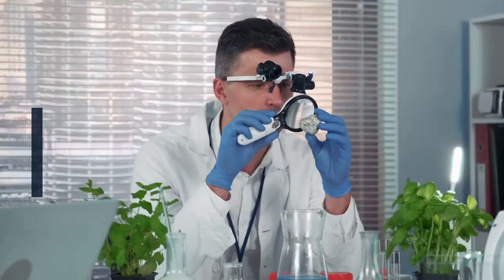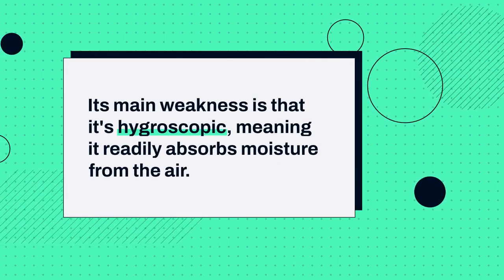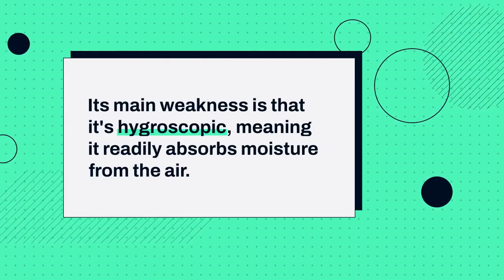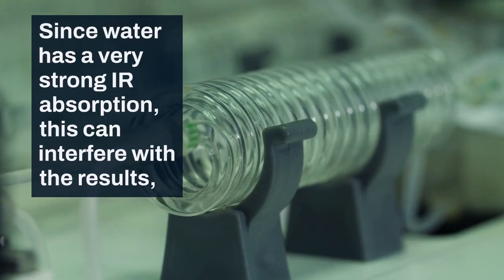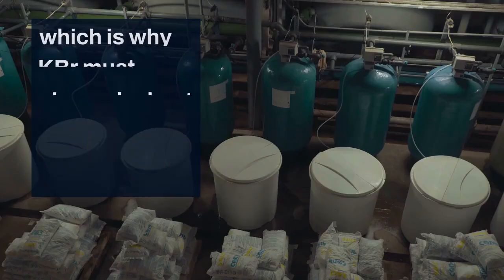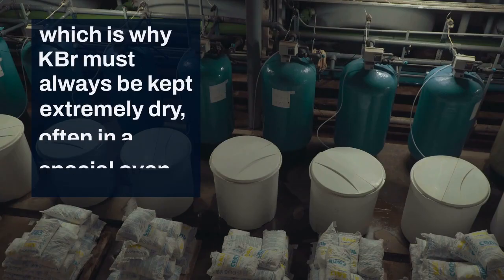Of course, KBr isn't perfect. Its main weakness is that it's hygroscopic, meaning it readily absorbs moisture from the air. Since water has a very strong IR absorption, this can interfere with the results, which is why KBr must always be kept extremely dry, often in a special oven or desiccator.